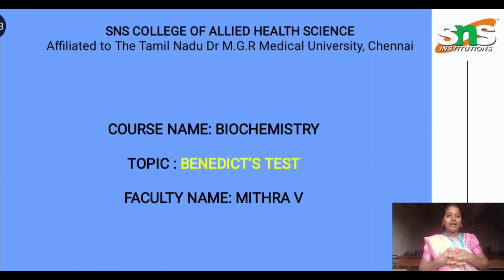Hello everyone. Today we are going to discuss an important topic in biochemistry which is related to the biomolecule carbohydrate, and that is the Benedict's test. The overall significance of the Benedict's test is to detect the presence of reducing sugar in a particular sample. We will discuss it in detail.